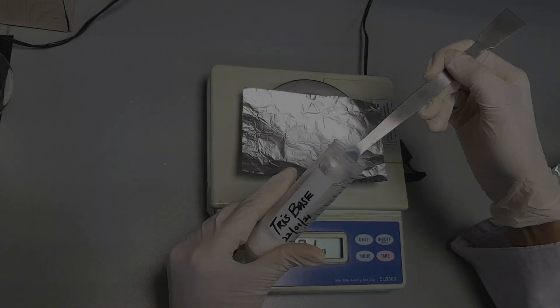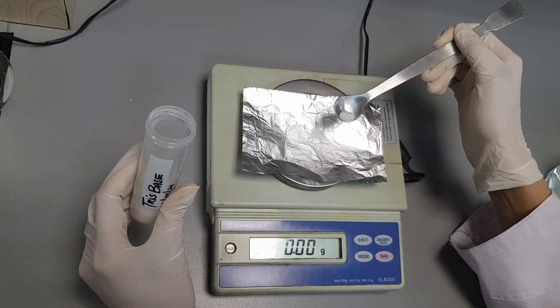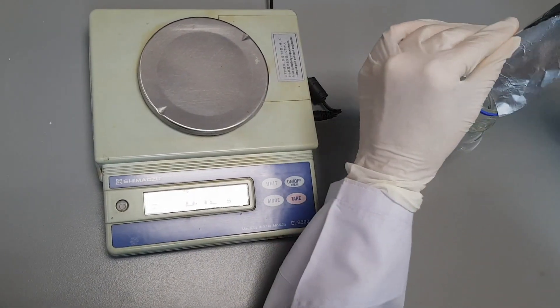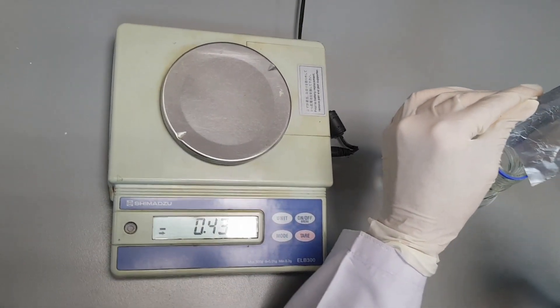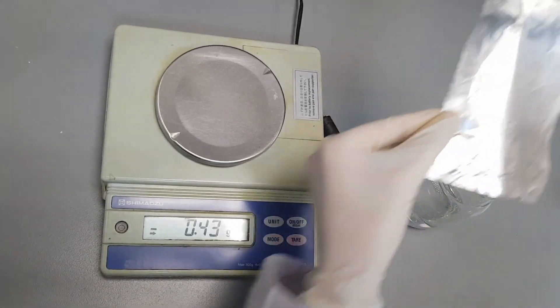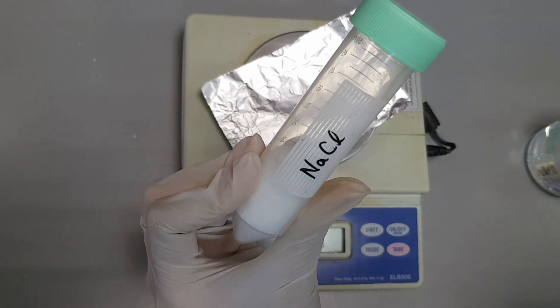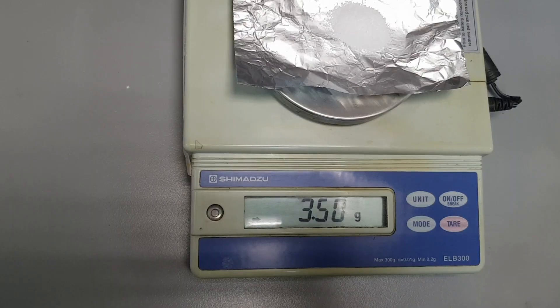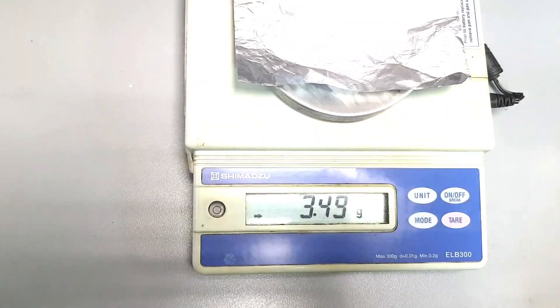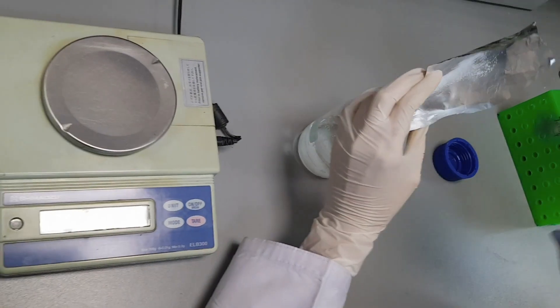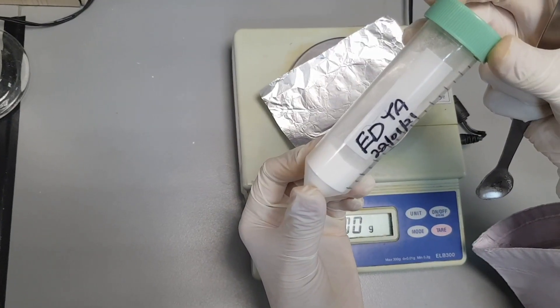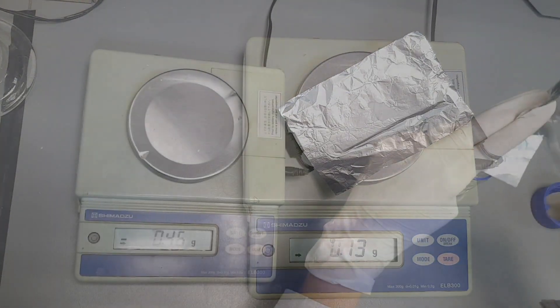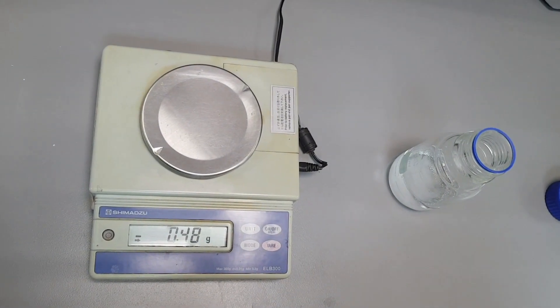Now by using a weighing balance, weigh out 0.18 grams of tris and add it to the reagent bottle. Now measure 3.5 grams of sodium chloride and add this to the reagent bottle. Now weigh out 0.1 gram of EDTA and put it in that 100 ml distilled water containing reagent bottle.